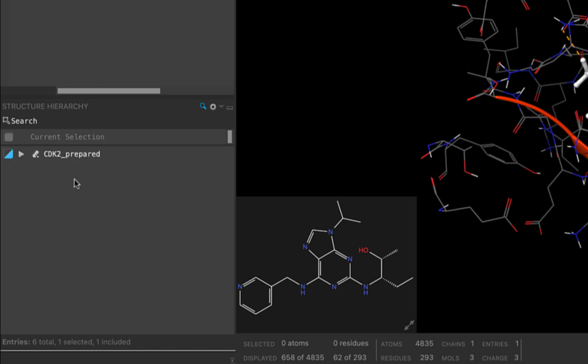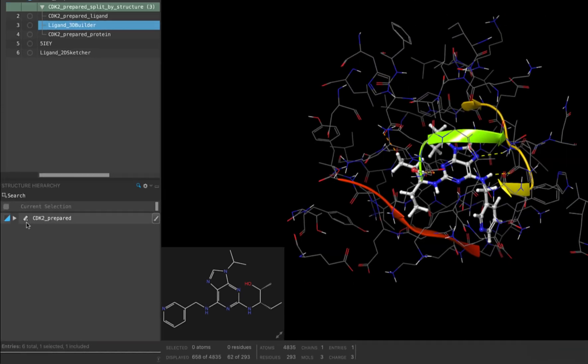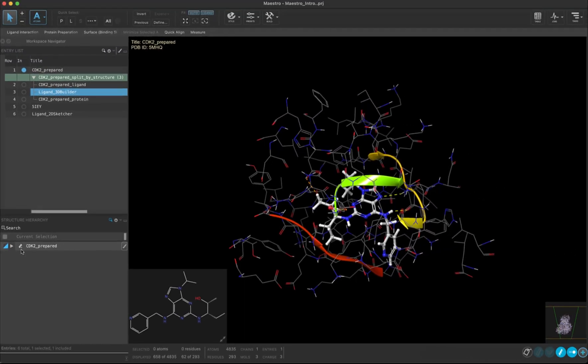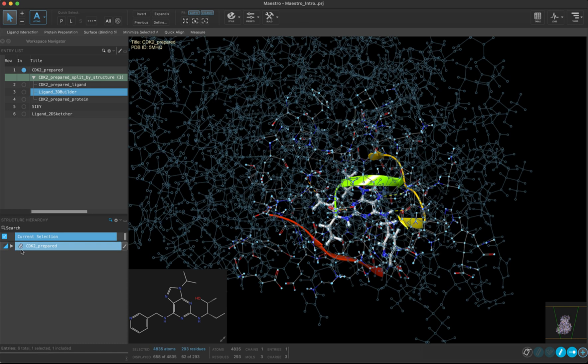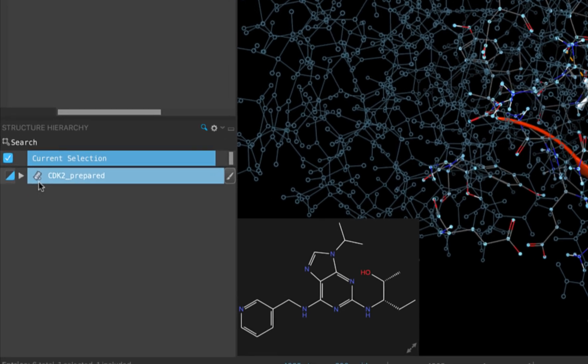Let's go down to the bottom left corner of the interface where we will find the structure hierarchy table. You can see we have one entry included in the structure hierarchy. This is the same entry that's included in the workspace. We can change how an entry is displayed by using the structure hierarchy.